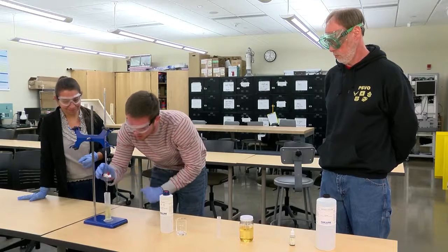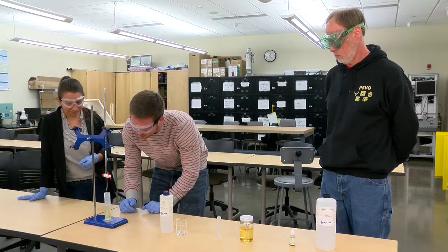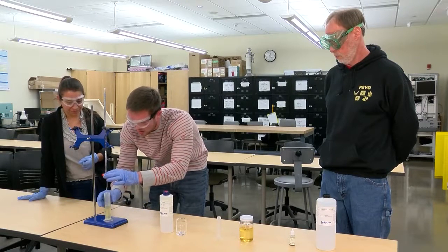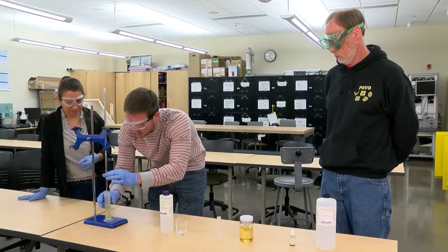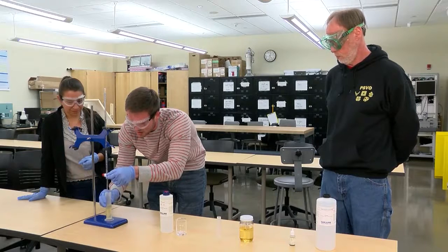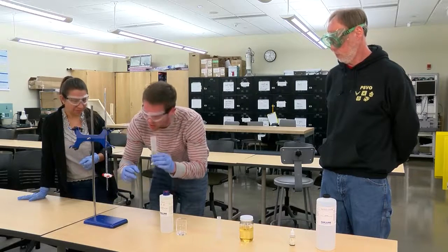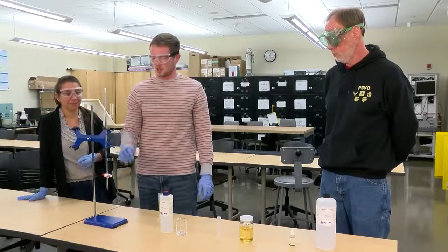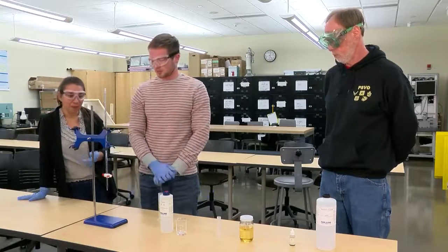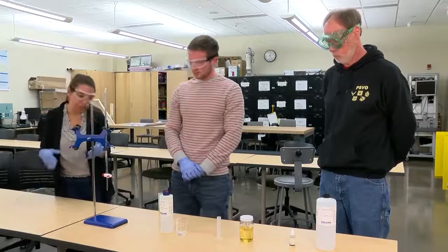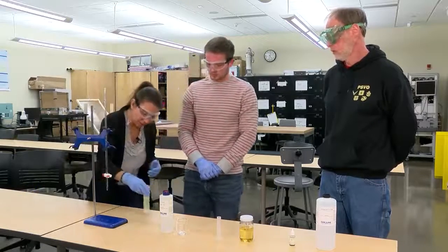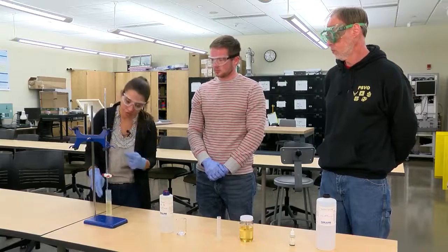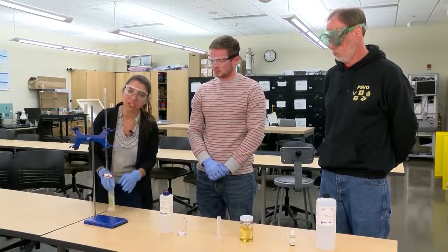Just a couple drops at a time. Once that changes color for about 30 seconds, that's how we know we've completed the process, and then we record how much we've used. This is a very simple process — by mixing it and looking at how much acid was required to change the color, we can determine what we need to know.